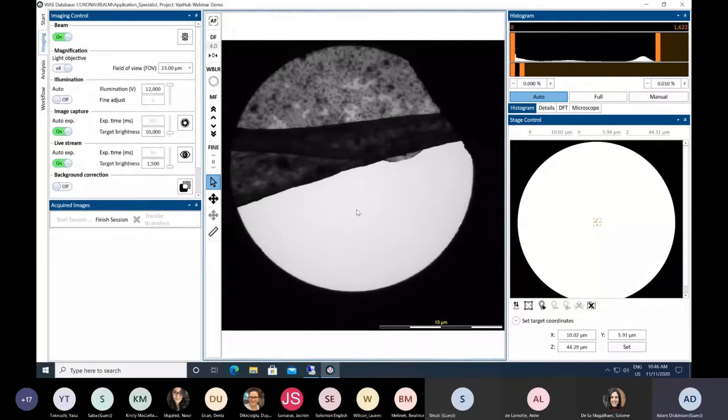From time to time, you may have some pixelation over time that you may want to remove, and this feature is here just if you do need to do that. Moving over to the right, we have our histogram here. So we have basically an intensity in pixels of our image. The camera goes from 0 up to 65,000 because it's a 16-bit camera, and these values will vary depending on where I am in the particular image.